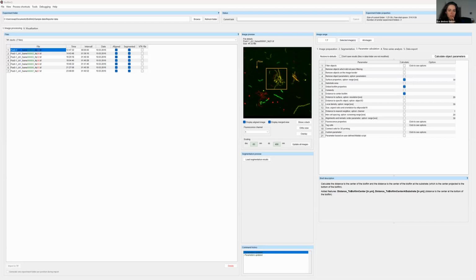And what are the chances of recording artifacts at single bacterial level segmentation in dense biofilms? Depends again on your data and your segmentation. For single cell segmentation, I would recommend going to the workshop tomorrow with Niklas, because some of the neural network algorithms are able to handle even quite packed images by basically giving them a ground truth and learning factors that you cannot capture with a classical image analysis.